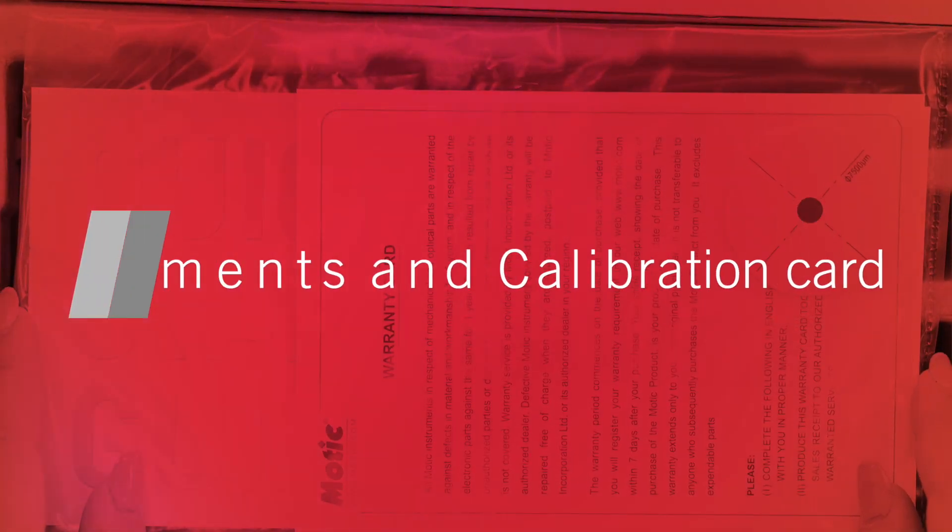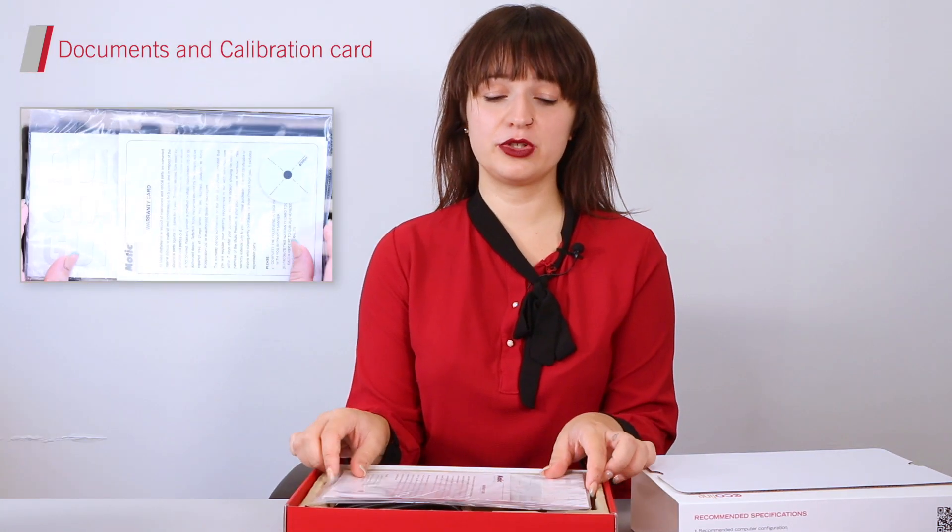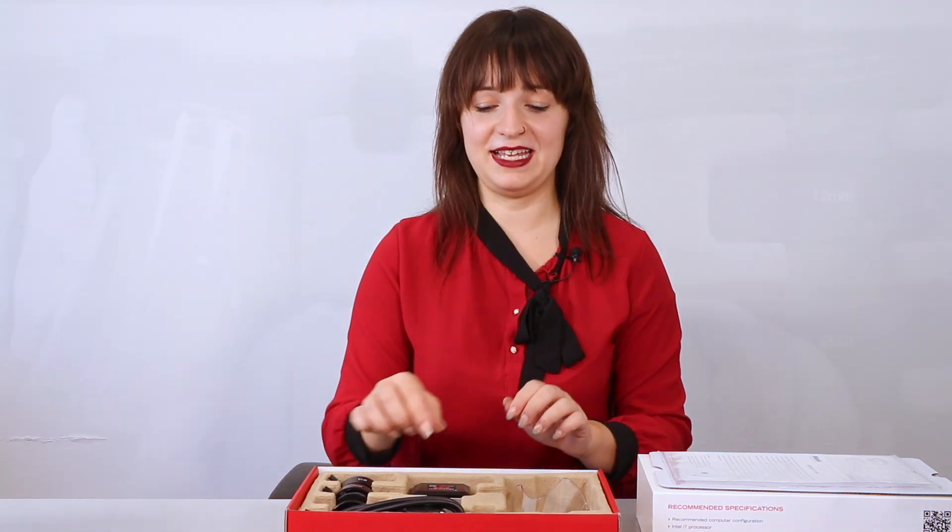After removing the plastic film, gently slide the outer box and remove your protection carton. The first thing that you will see is a small pouch containing your help guide, warranty card, and calibration card. All your items will be individually wrapped in small plastic bags, which were already removed in this case.